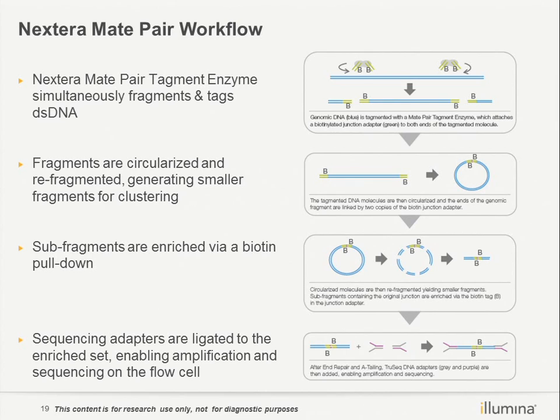Then we add the adapters to this fragment and sequence this small fragment, and then we will know the information of the 2 ends of these very long reads. Together with the other small sequences, we can first construct this large fragment, and then we further construct many large fragments like this to get our genomic DNA. So still 2 steps.